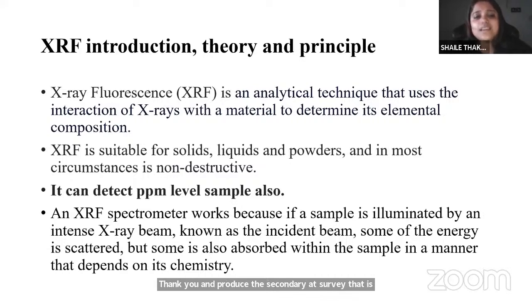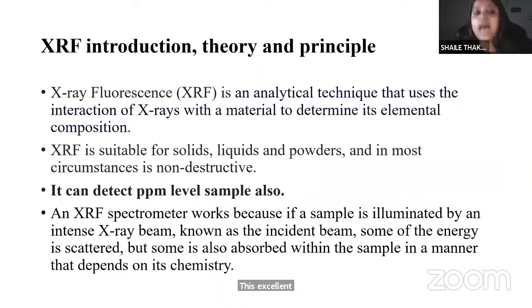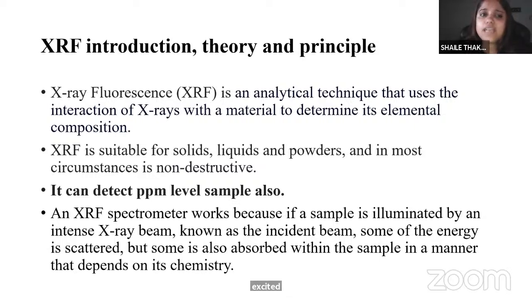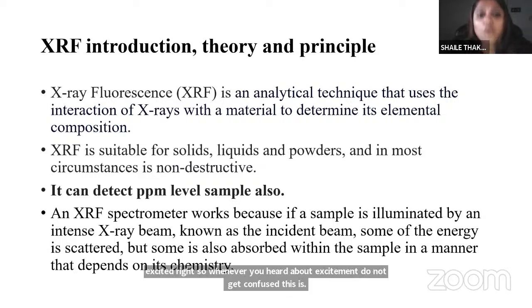So basically this technique utilizes the interaction of X-ray with the material to determine the elemental composition. In short, this X-ray fluorescence spectroscopy is also known as XRF, right? So whenever you hear about XRF, do not get confused. This is nothing but X-ray fluorescence spectroscopy.